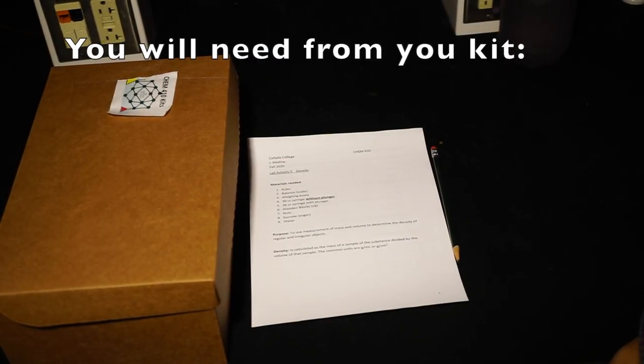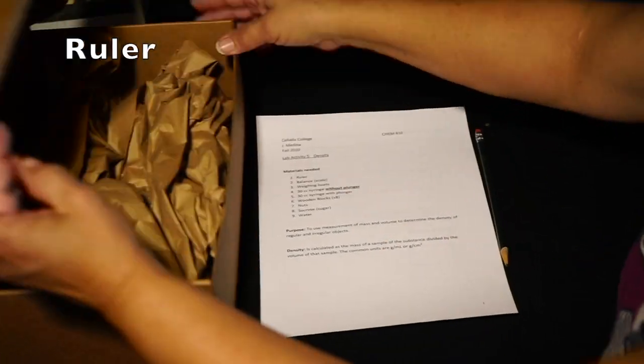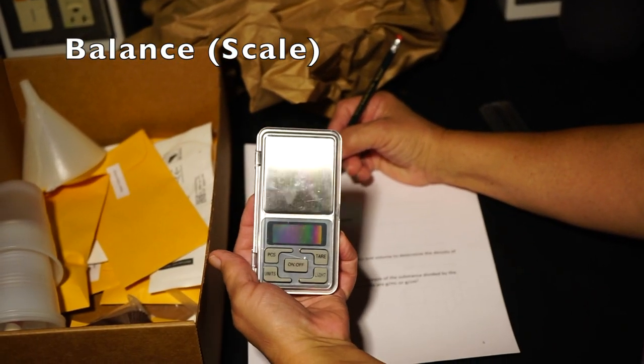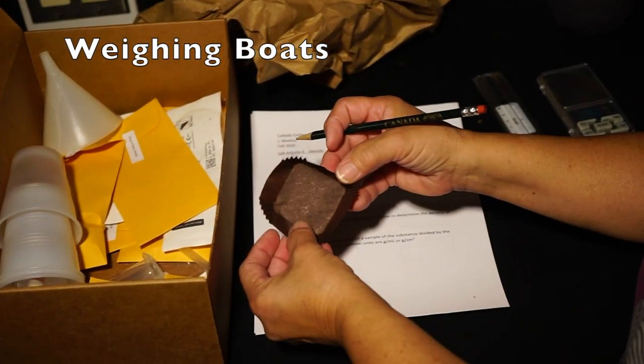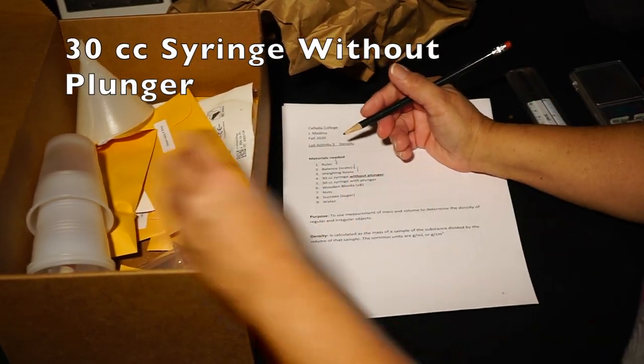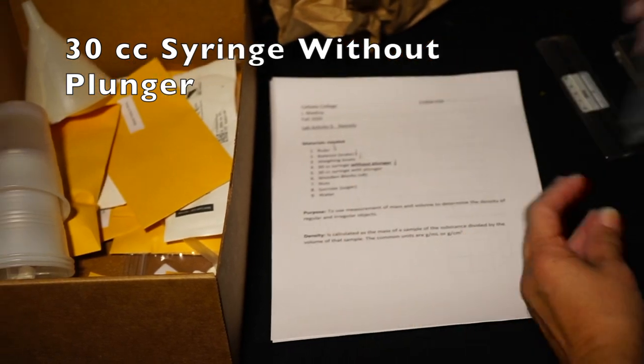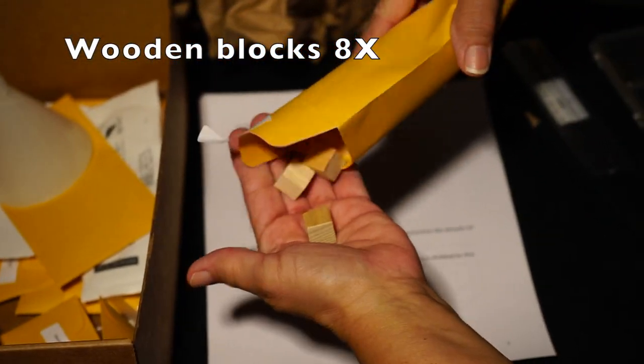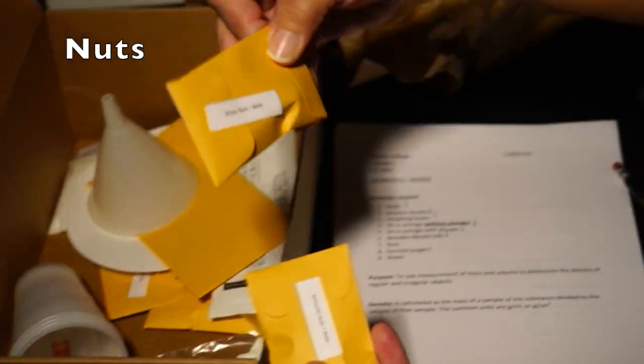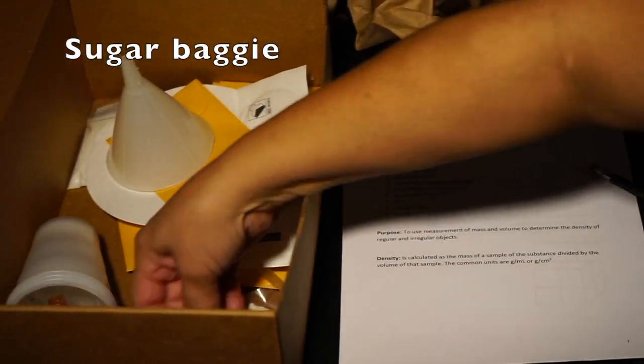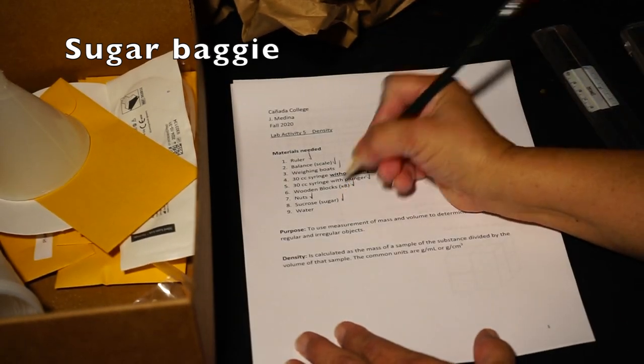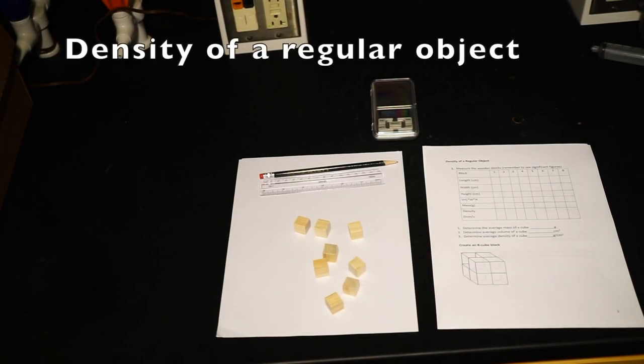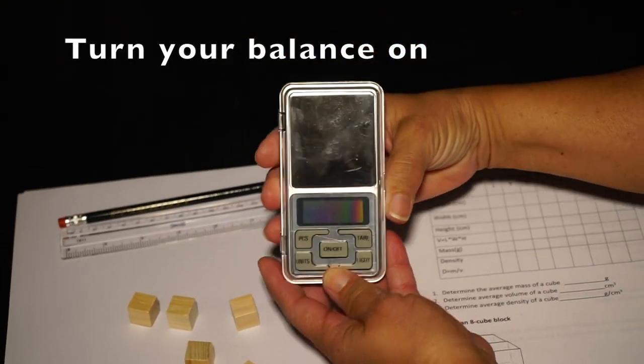You will need a ruler, balance or scale, weighing boats, 30 cc syringe without plunger, 30 cc syringe with plunger, wooden blocks, eight nuts, sugar baggie, and water which you will provide.